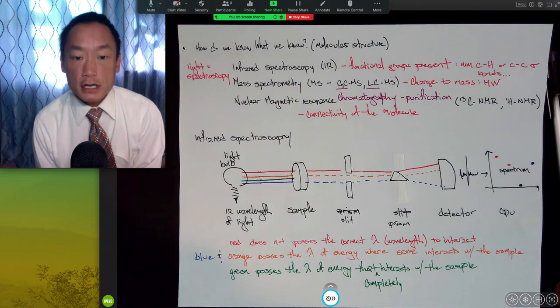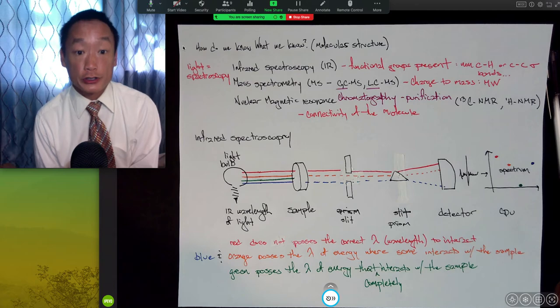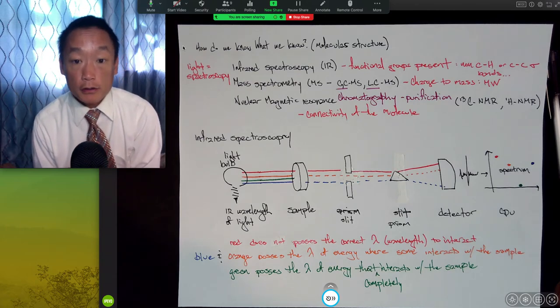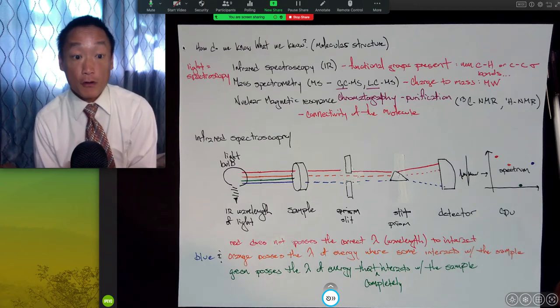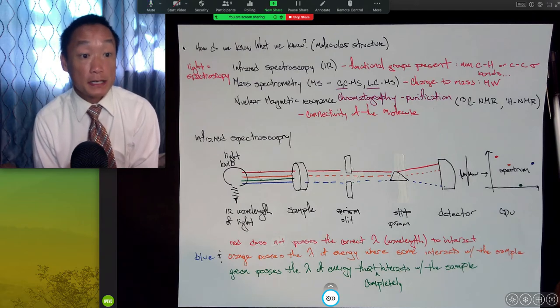If you understand how the test works, you can understand your confidence in the results that you get. And so as you head off to medical school, I implore you to always understand the test that you are getting data from, to understand when or when not those tests need to be trusted.